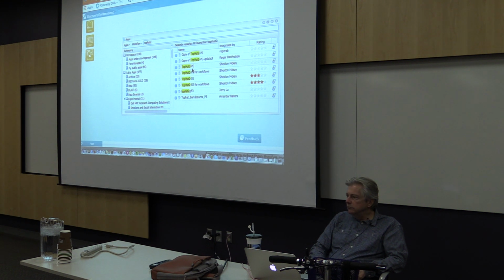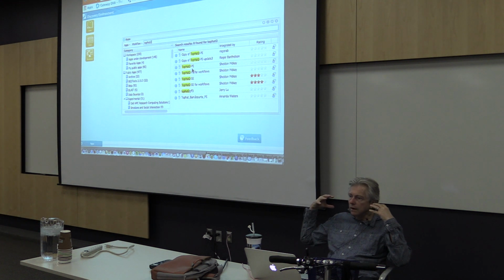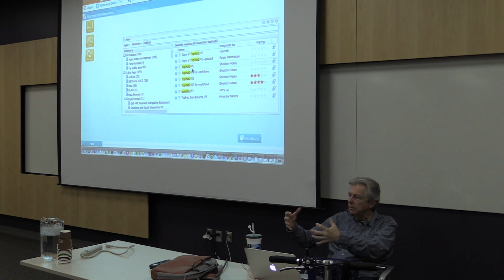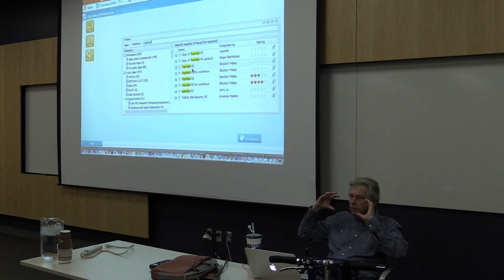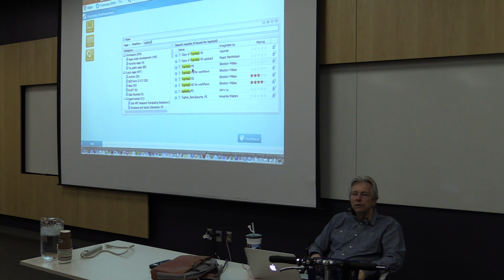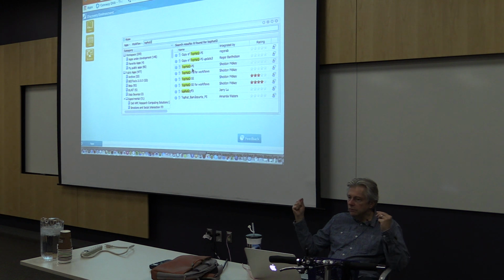Paired end sequencing means that the reads, when you develop your samples for sequencing, you'll often pull out a chunk of cDNA that may be slightly amplified, but it's essentially, you often will take your fragmented cDNA, select a specific size chunk, and if you're doing single-ended sequencing, you're sequencing from one side. If you're doing paired-end sequencing, you're sequencing from both ends, but you're not just doing that randomly. The process preserves the fact that on this single read, you're reading from one end this way and from the other end this way.